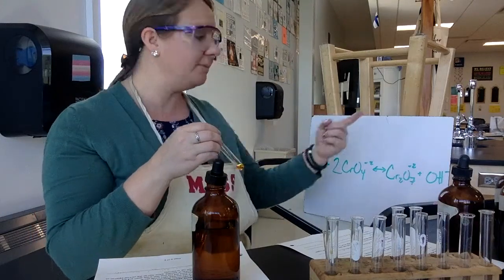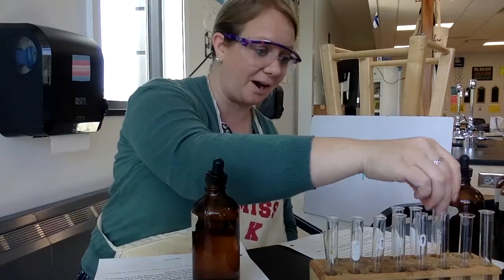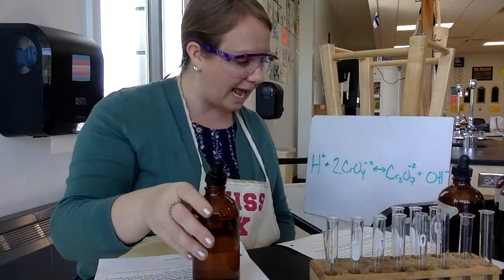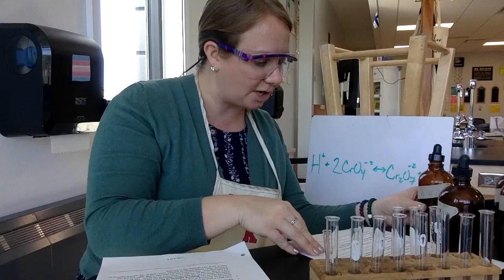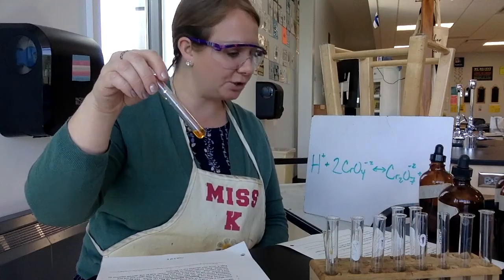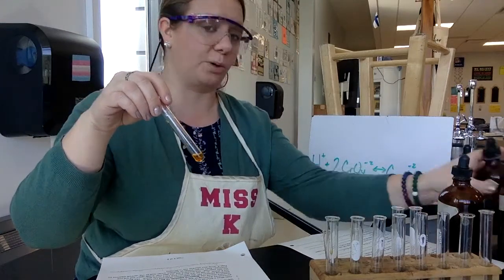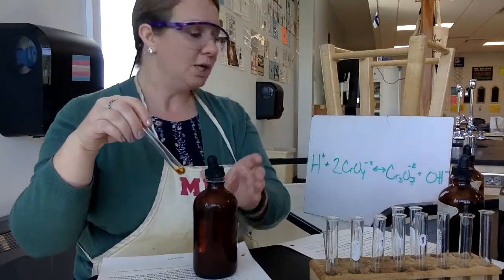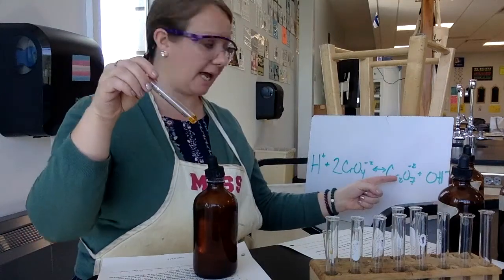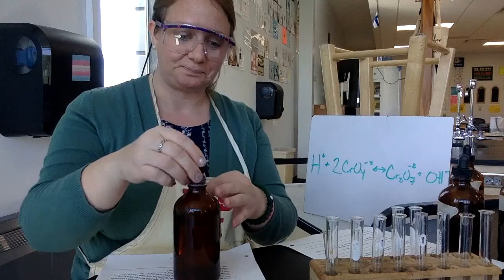I added reactant, shifted to the product to try to get itself back to being balanced. All right. The next one it asks to do is it says to start with the same test tube, all right? So that same test tube we just used, but this time we're going to add OH ions to it. So again, think about what that would do. So I'm on this orangey side. I'm going to add OHs. What do you predict you will see? Go ahead and make that prediction.